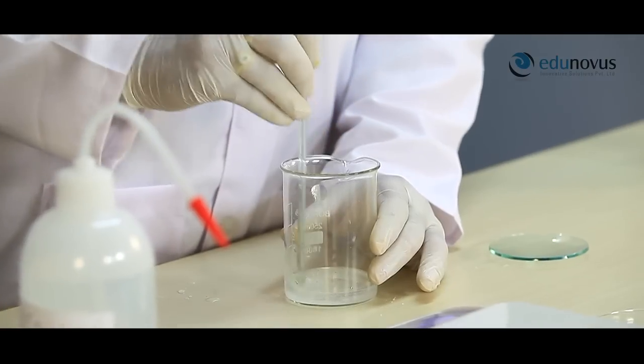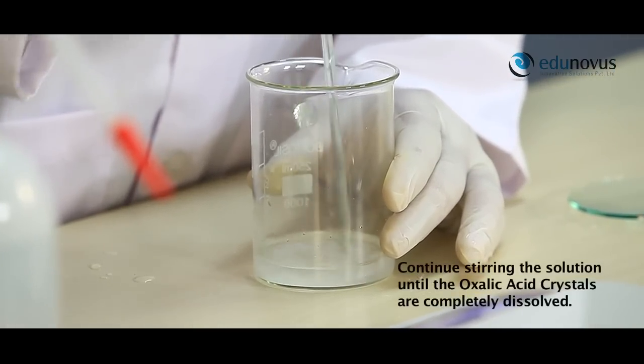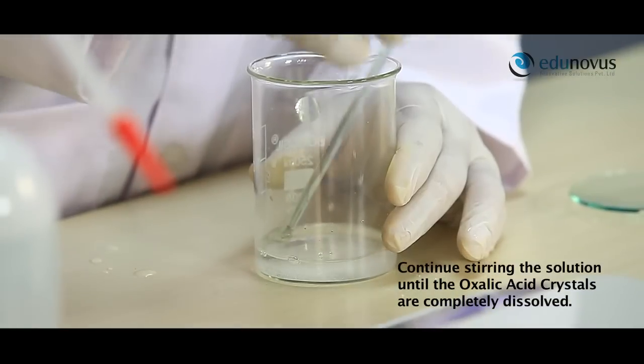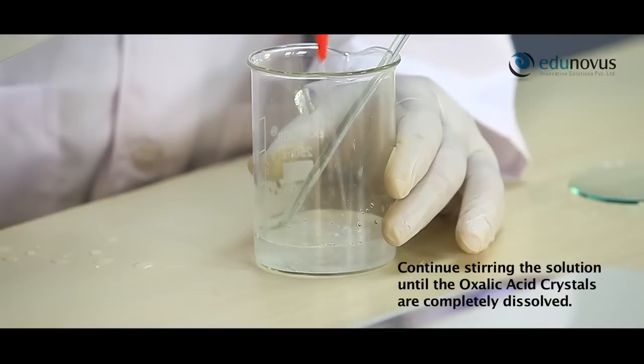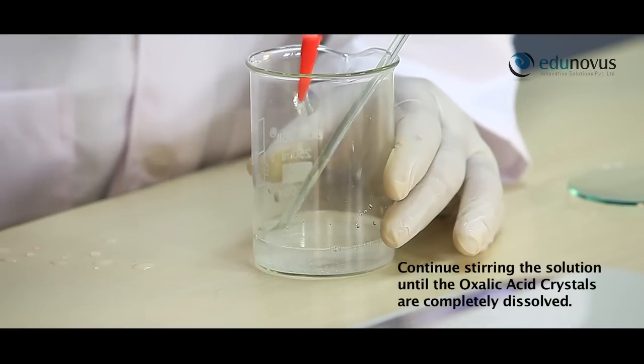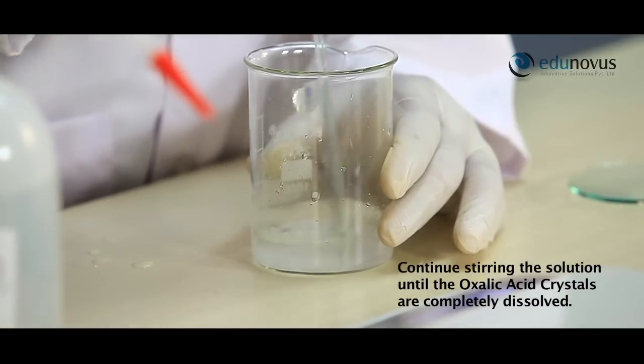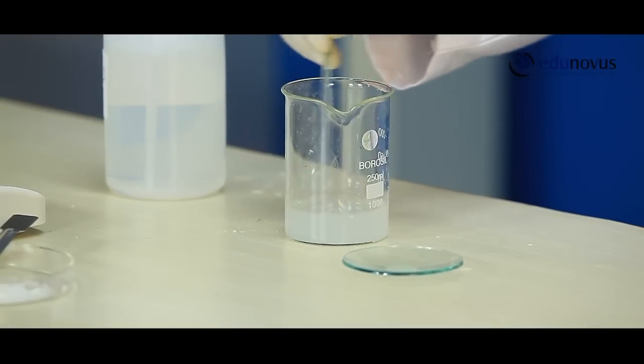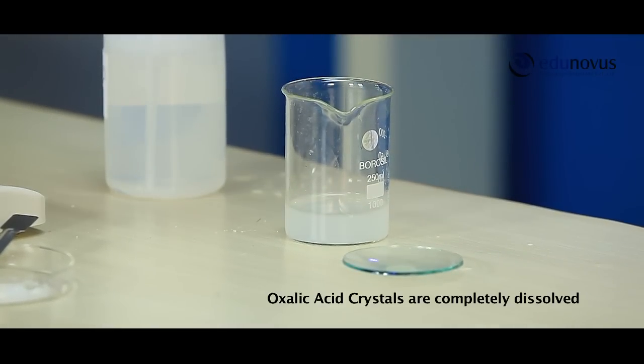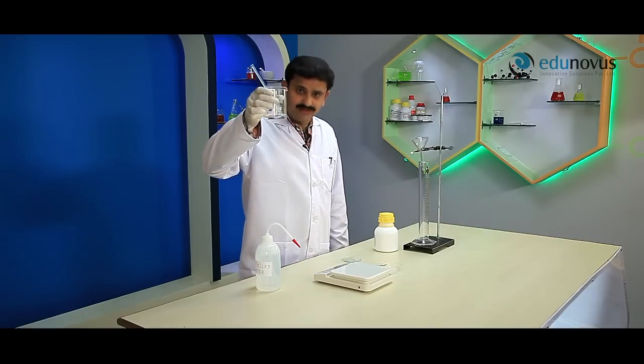Let the oxalic acid crystals dissolve by stirring gently with a clean glass rod. Here in this moment you can add a little amount of water if needed. Here you can see that the oxalic acid crystals are completely dissolved.